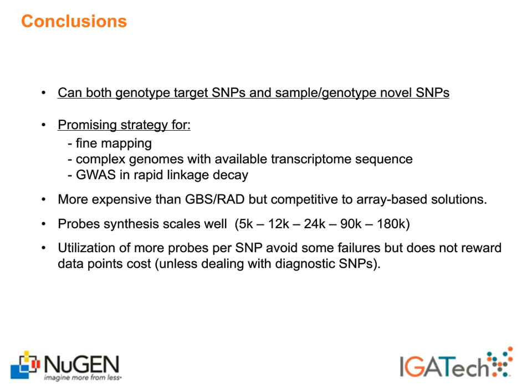It's a technique that is still more expensive than traditional GBS or RAD systems, but it's very competitive to array-based solutions. Also, the ability to scale easily on probe synthesis scales is very helpful to design the most cost-effective strategy.